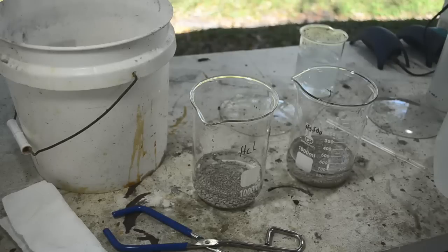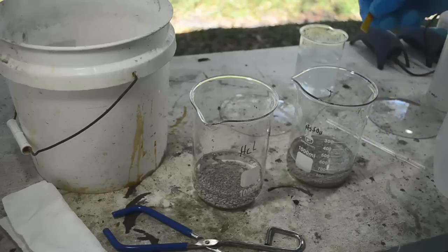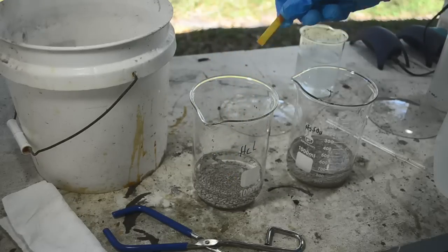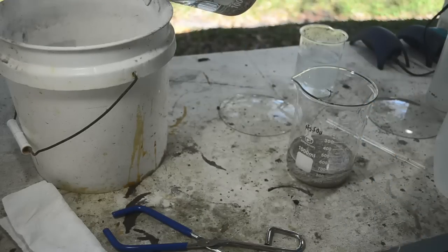Alright, I've given both of these quite a few rinses, but it may not be enough yet. Let's check with some pH paper. See, that's still a little bit acidic, the hydrochloric acid, or the sulfuric acid one. Let's see about this one. Just a little bit. So they're both still a little acidic, so they both need some more rinsing, which is exactly what I figured. It takes a lot of rinsing to get these back down to neutral. It really does. So we'll just rinse them some more and then test again.